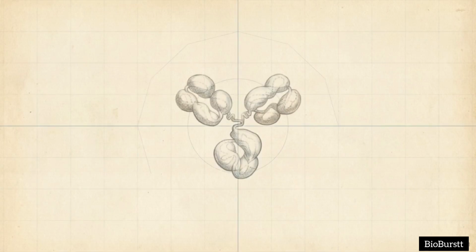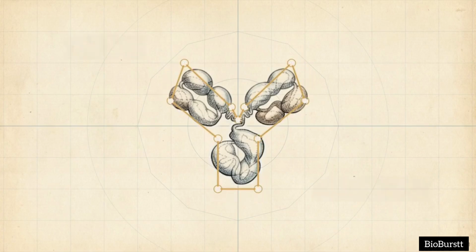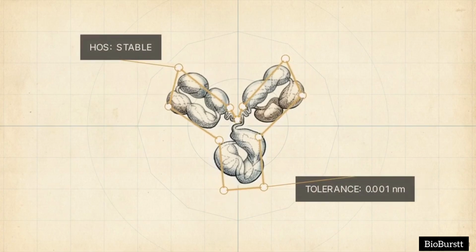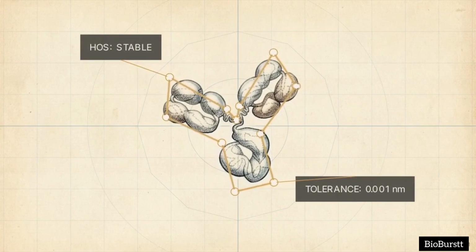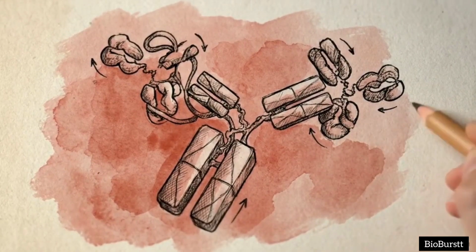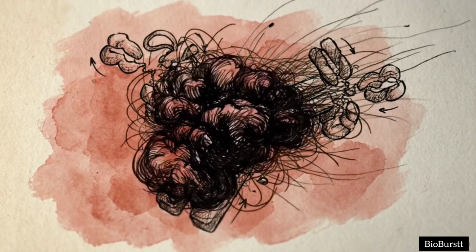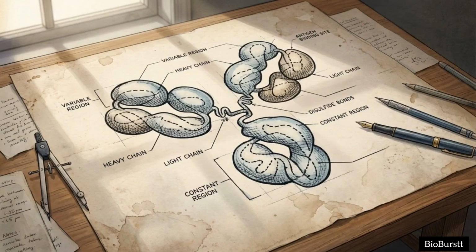Biologic drugs operate on precise geometric tolerances. An antibody's entire therapeutic function depends on its specific three-dimensional structure. If it fails to hold that structure and folds incorrectly, it ceases to be a treatment and becomes an immunogenic hazard. To manage these risks, the industry utilizes quality by design.